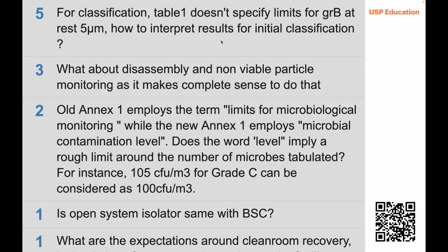With 29 particles per cubic meter, you're measuring at a cubic foot per minute, which means the limit in 1 minute is 29 divided by 35.2, which of course is a fractional number, which doesn't make sense. So you can't look at it every minute. You have to look at it over a couple of minutes, and you're literally dealing with single particles in the measurement sample. That's really hard to do with an electronic instrument because you can have electronic noise and you'll see a particle that's not there. So it's real. I agree, this is really going to continue to be challenging.